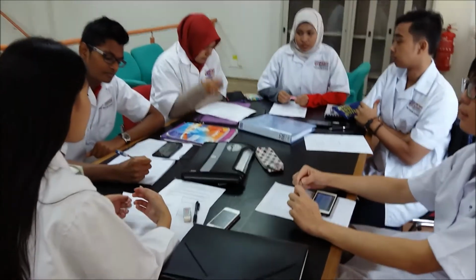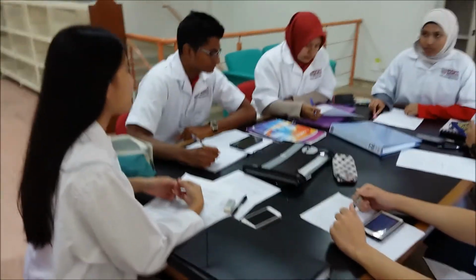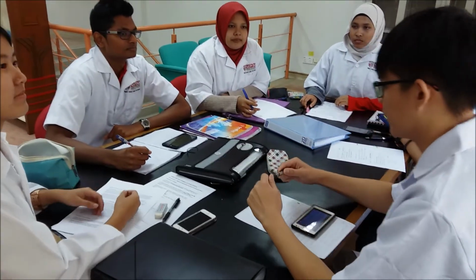Okay, so today we'll have the first LAX activity to discuss why we use spectrophotometry in biochemical assay. Let's see. Okay, so we'll start off with a discussion on what is spectrophotometry.